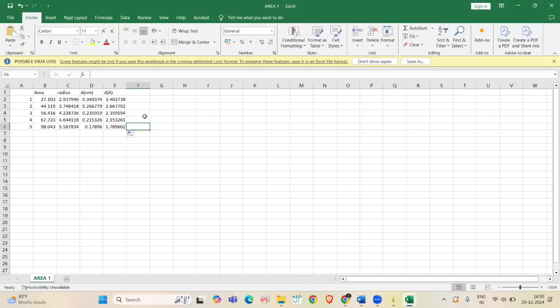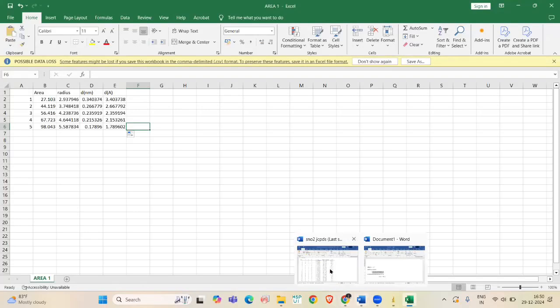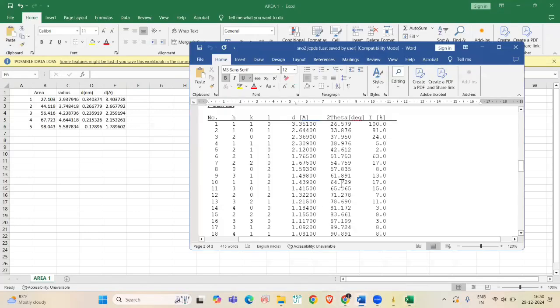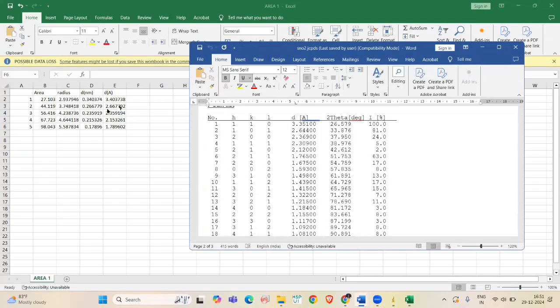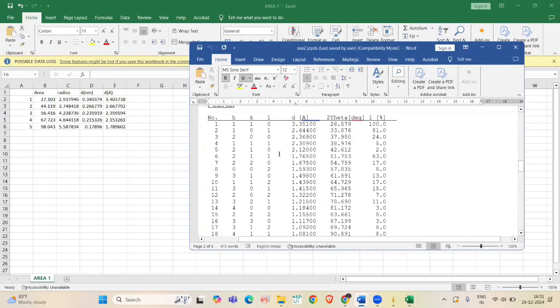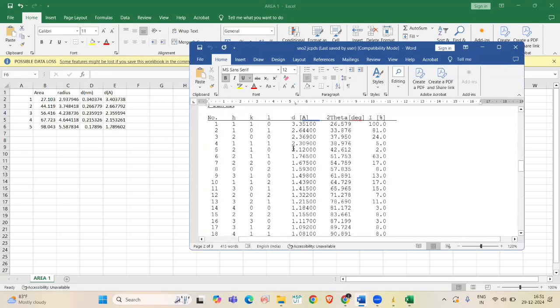Now, compare the calculated D spacing values with the standard JCPDS card to identify the HKL indices for the diffraction ring. Here, this is the JCPDS value of SnO2. The first value is 3.40 and here 3.35, its HKL value is 110. Second value is 2.6, here 2.64, and here 2.35 and 2.12.